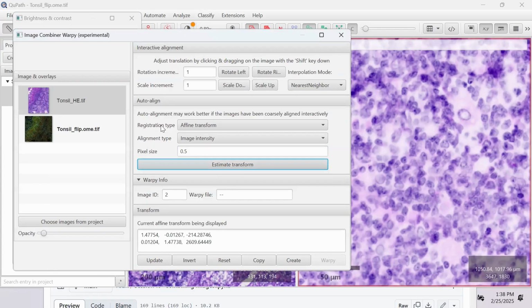And the note in the GitHub says that once you get this transform matrix, it's a good practice to copy it into a text file and save it. That might be useful for future more advanced analysis when you're going to be transferring objects from one image to another. Yes, if your computer crashes in the next step and you have those numbers copied into a notepad, that's going to be pretty helpful. So I'm going to listen to that advice and I'm going to do it as well.